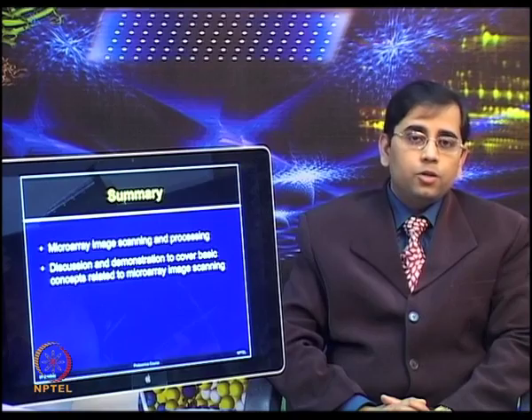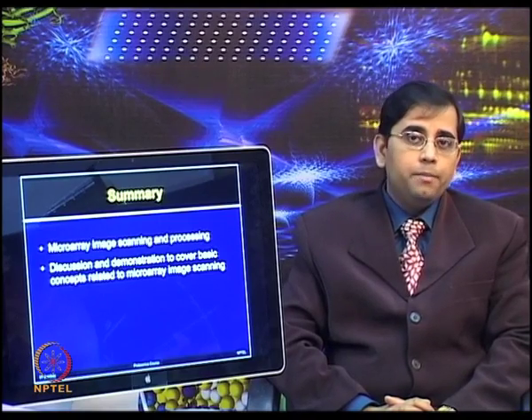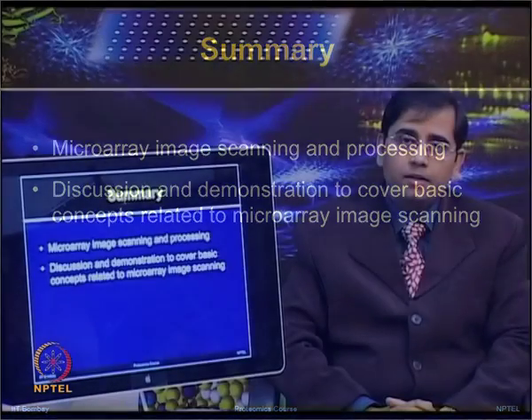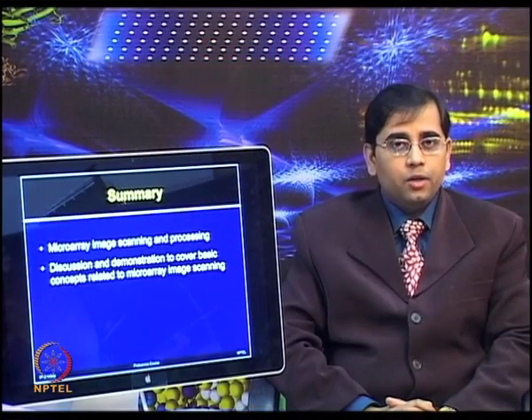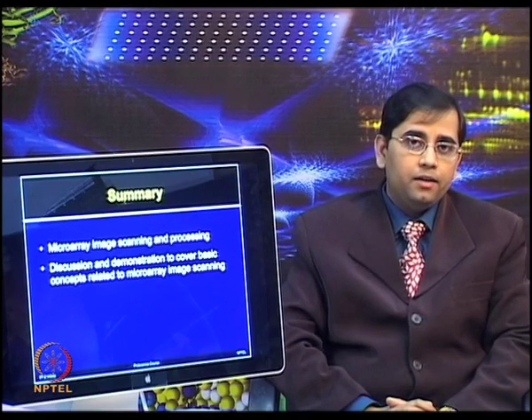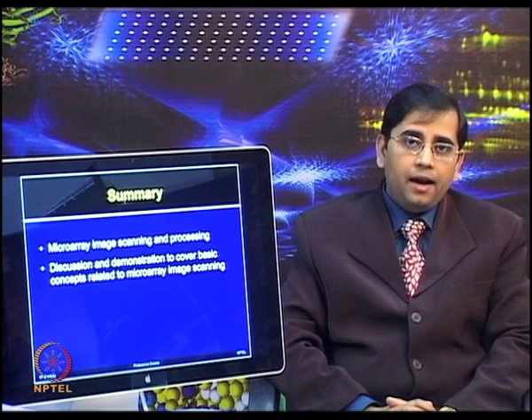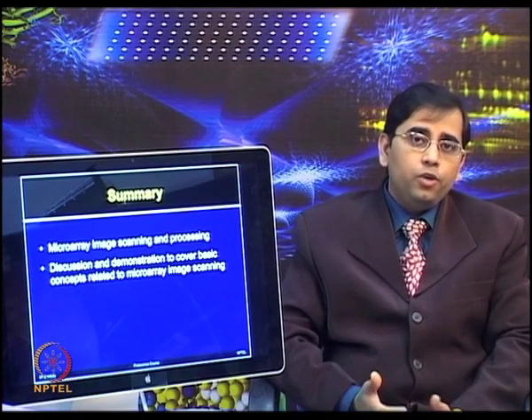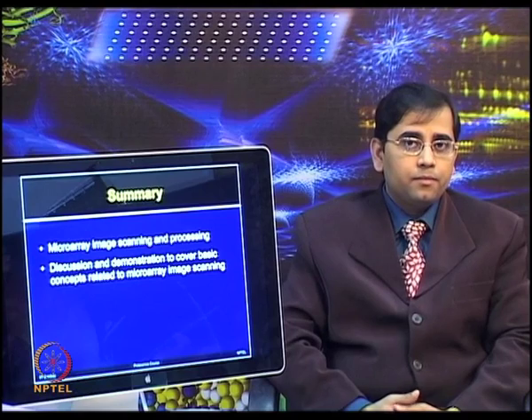Thank you. So in summary, today we talked about microarray image scanning and processing. We had a discussion and demonstration to cover the basic concepts related to microarray image scanning and processing. One needs to look at various parameters while scanning the images and processing them, because that is very crucial for further data analysis.